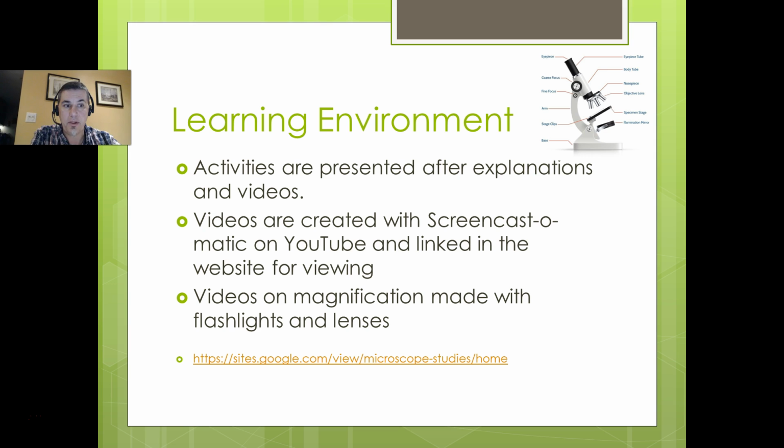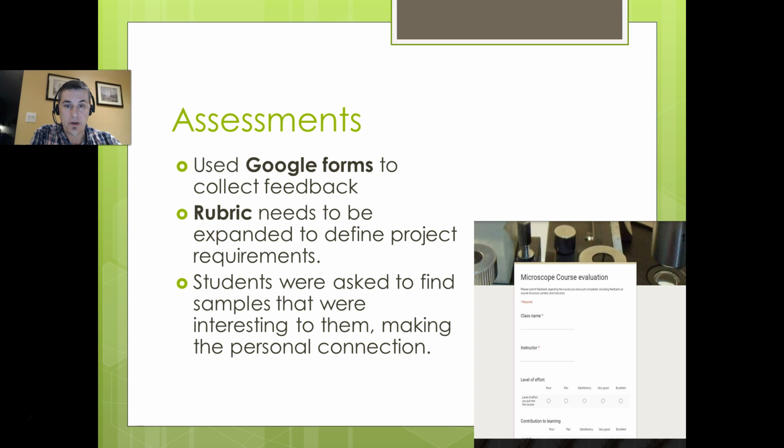You want to learn about how the light works, how the bending of light works as to create magnification. Did some great videos on shining light through different optics from an actual microscope and see how the light would change as it enters and exits the lens. It demonstrated how images were enlarged as you look at them through the different lenses in the microscope. So really a lot of imagery, a lot of videos.